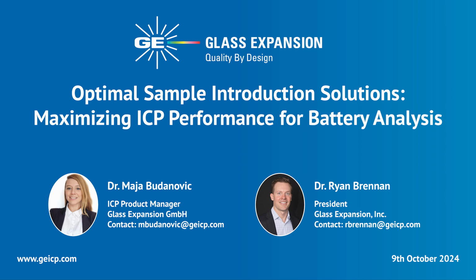Today we will discuss how to get the best results from your ICP system for battery materials. I will start by covering how to choose the right sample introduction components and share maintenance best practices. Then Ryan will present a case study showcasing improvements in ICP OES analysis of lithium battery electrolytes.